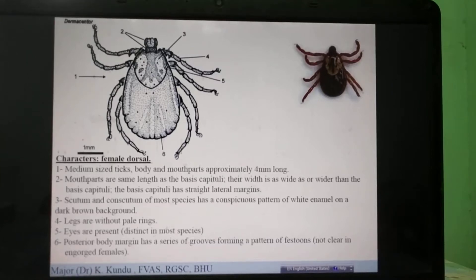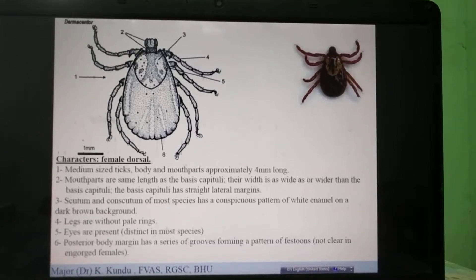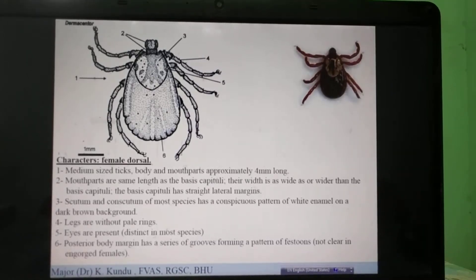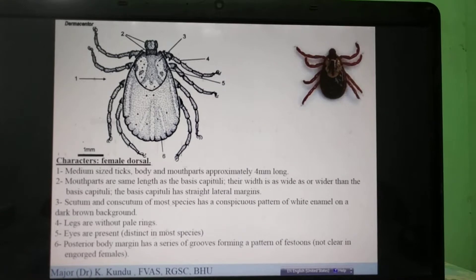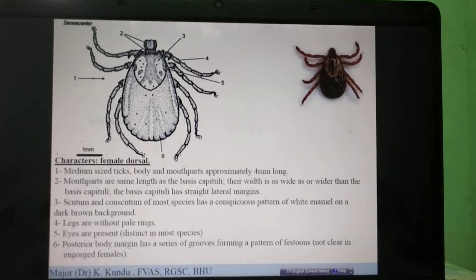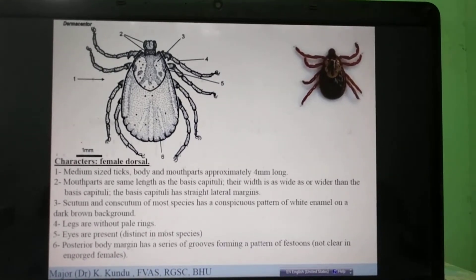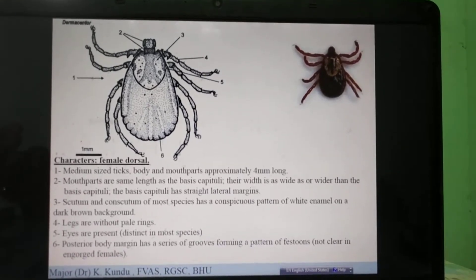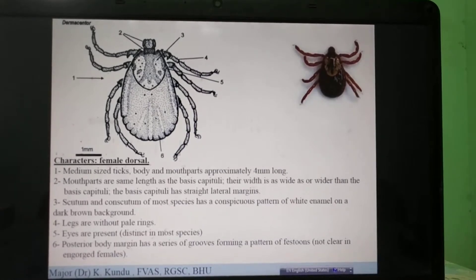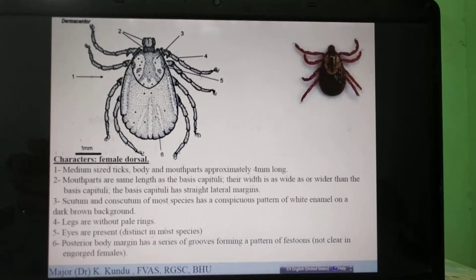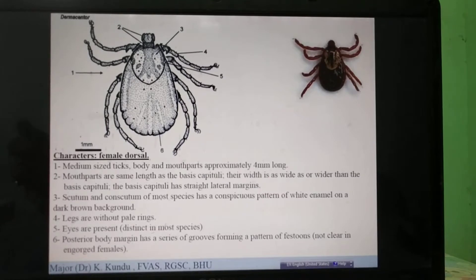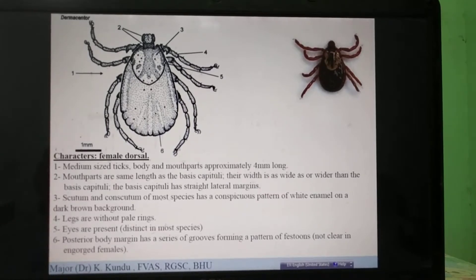Coming to the second part of the identification of ticks based on morphology. We previously discussed the genera Rhipicephalus, Hyalomma, and Amblyomma. Now we will finish off with three other important genera.